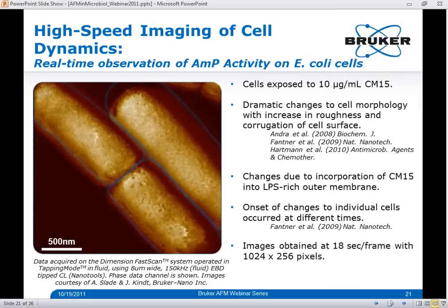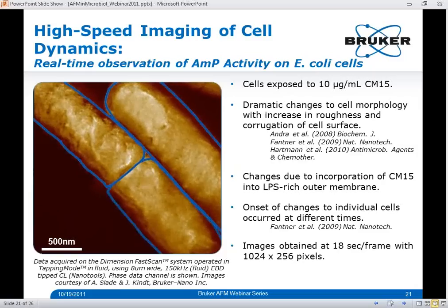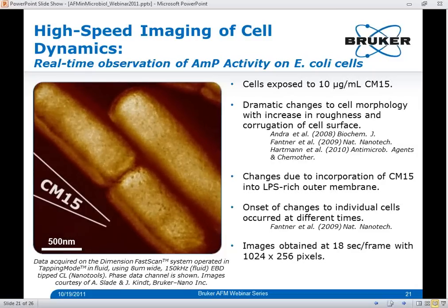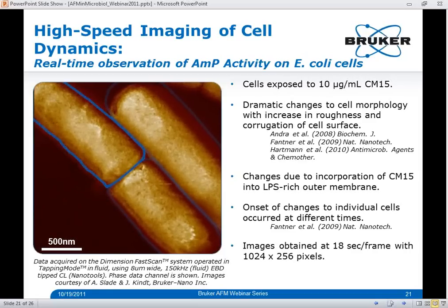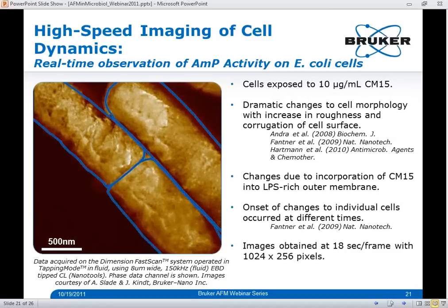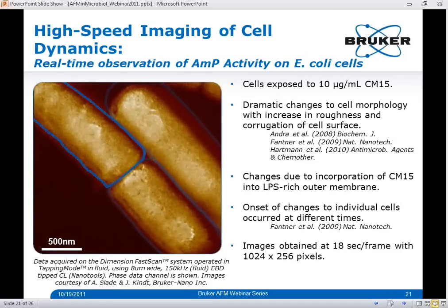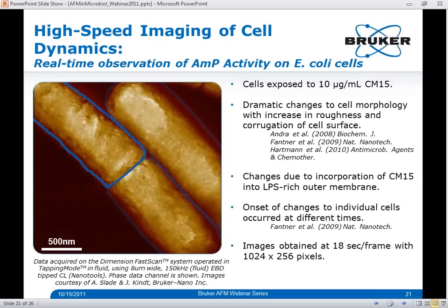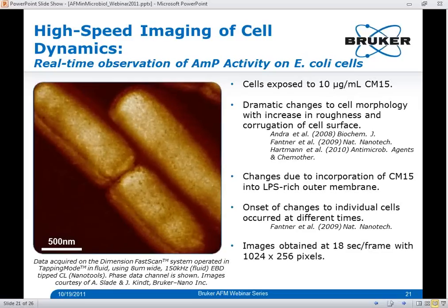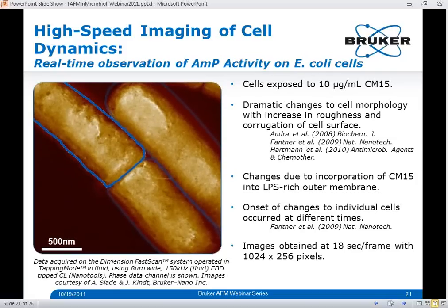While previous AFM studies have shown similar changes in the gross morphology of bacterial cells in response to antimicrobial peptide exposure, being conducted at traditional scan rates they could only capture consecutive images over long time intervals on the order of minutes. We were able to demonstrate, at increased AFM time resolutions with the FastScan AFM system, that we can directly observe the dynamic effects of CM15 within seconds after exposure, and detect variations in the onset of these effects on individual cells at nanometer length scale — initial interactions that would typically not be detected at traditional AFM scan rates.